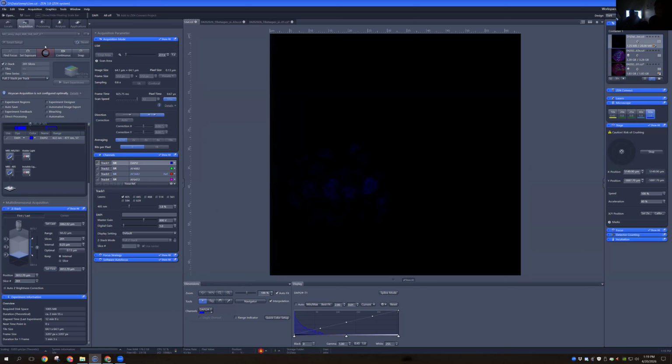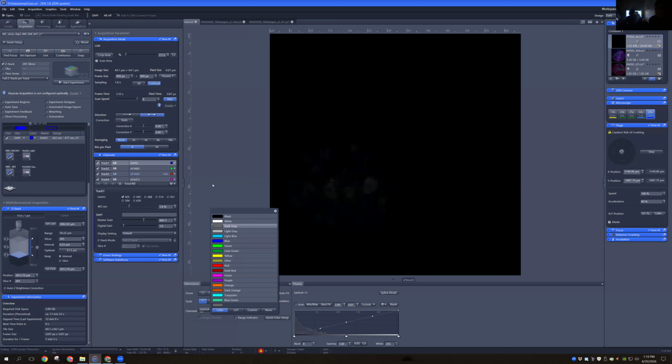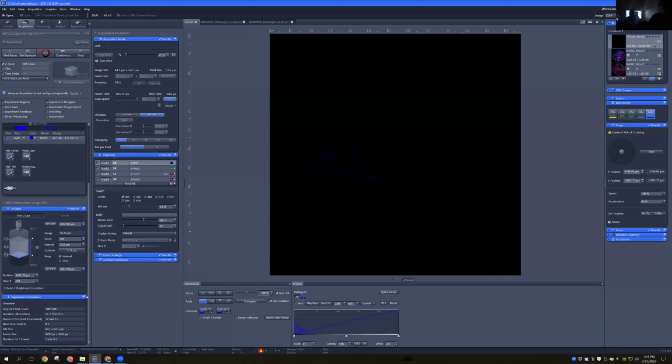Actually, let me stop really quick. I typically like to have my DAPI always in gray for people to see. That's what is on my images on the slides. So I'm just going to change what that looks like on the scope. So we go live. I'm at the bottom of, okay, well, it's back to blue. It's the same thing, just blue.